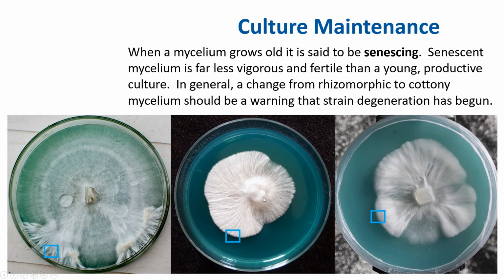Just keep in mind that when you do plate out fungi, you don't have to put one giant agar plug in the middle, right? Make sure you get a tiny section of it, because these are microscopic. If you nick a tiny section, it'll grow out just as well, and there's less chance of contamination. For me personally, I like to put 4, one right here, one right here, one right here, and one right here, and watch the growth. And I select the best one from there, and I transfer that to make my master plate, basically.